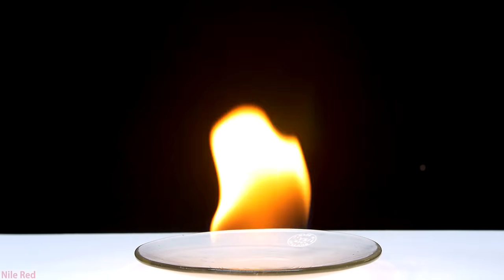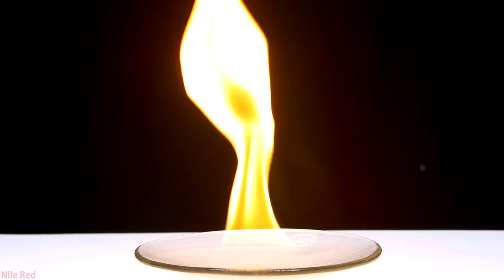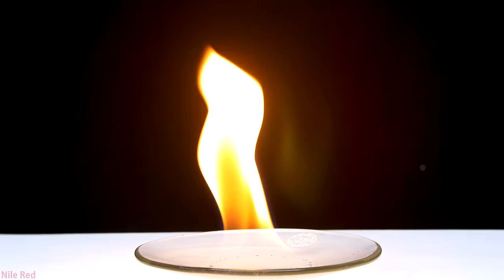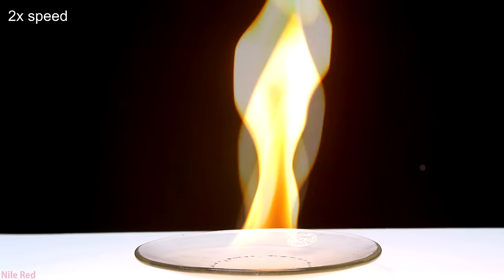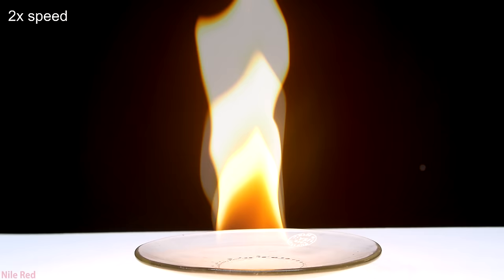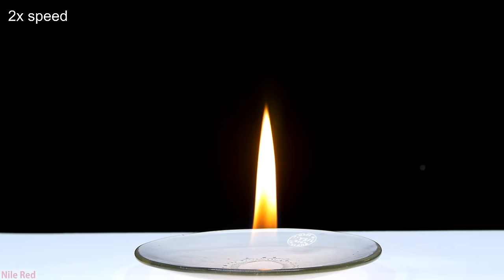Just for fun, I test out the flammability of the acetone that I made. As acetone normally is, it's extremely flammable, but the thing to note is that you can see that once the fire goes out at the end, there is a residue that's left behind. This is a strong indication that the acetone is not pure, and like I said before, if you want to use it for anything in synthesis, I would strongly recommend distilling it at least a couple more times.